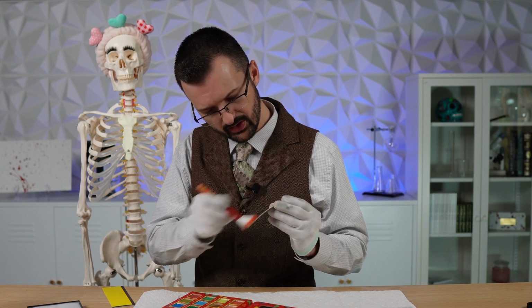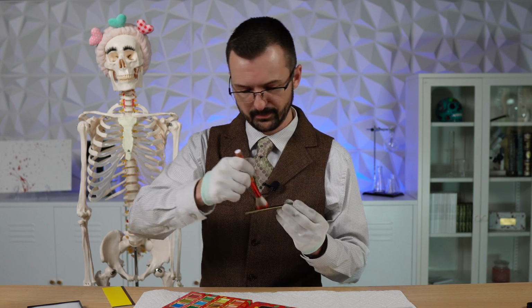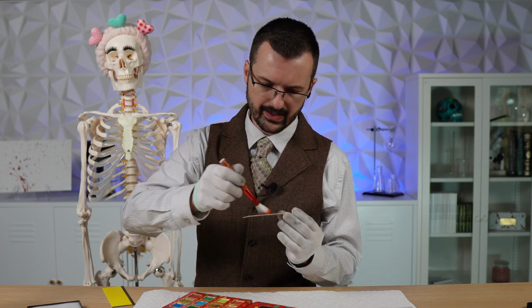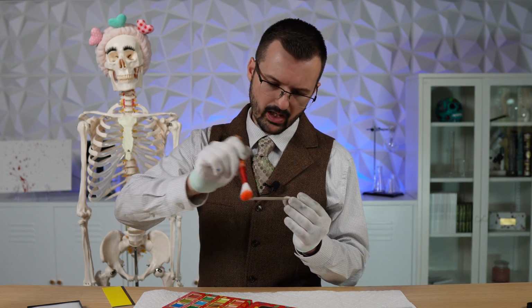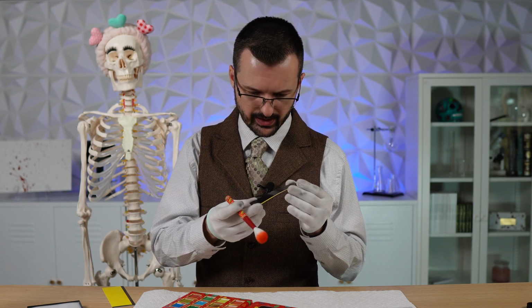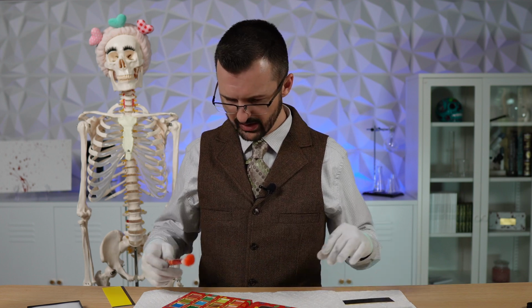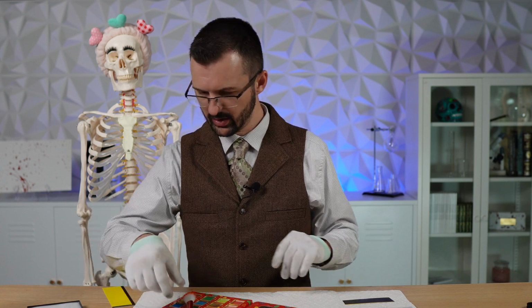You can never go wrong with taking your time to build up a fingerprint. You can definitely go overboard and use way too much powder, and then you end up destroying your fingerprint. It really is just building the print up little by little, and being soft and gentle, because once you destroy it, there's no going back. Not really getting anything good on that one, so let's try a different color. Let's try one of these dark ones on this white plastic.